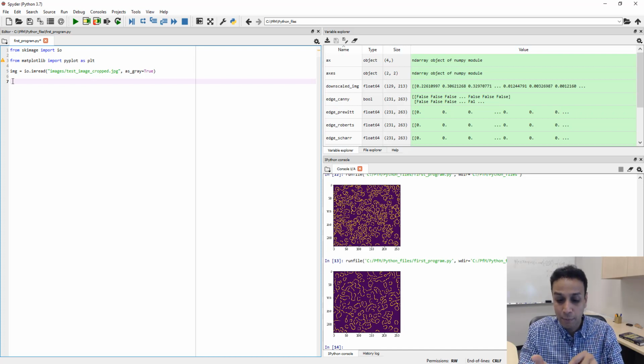At that specific spot, instead of being one single pixel or one dot, it actually spreads, right? When you shine a light onto a wall, you see the bright region, but then you see this halo around it. So when you're imaging, that halo also contributes towards your image.